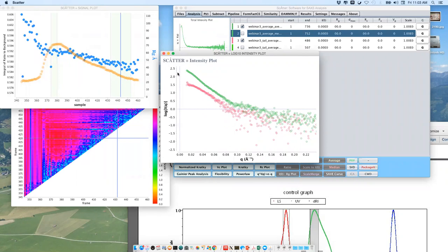Perfect. So that's the reason why we need to worry about this kind of non-perfect separation, especially when you have weak complexes. So what we apply in this case, you try to deconvolute, and that will also increase the signal to noise ratio. If you deconvolute the entire peak and get the signal for the complex state and non-complex state, you also get a better signal because you're using all the frames instead of just parts of the frames that we collected.